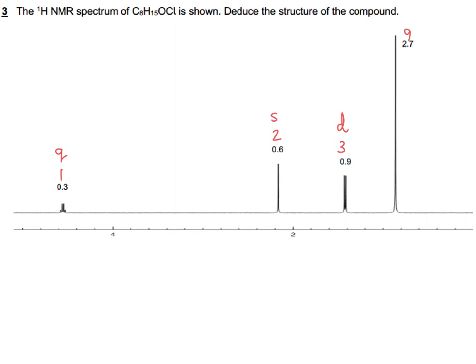And then finally we have a singlet. Leaping right out at me is this singlet with 9 hydrogens. We've had it before, I'm not saying this means it's really common, but it's definitely a thing to look out for. That means we have that end of the molecule.